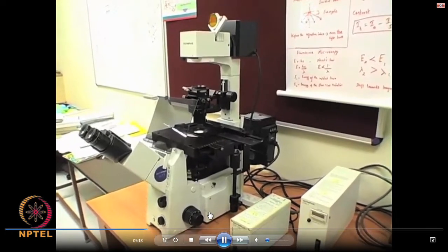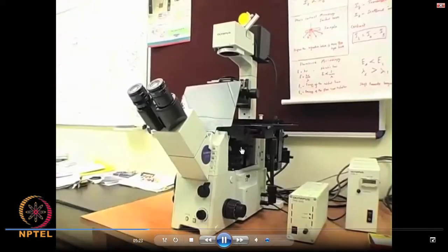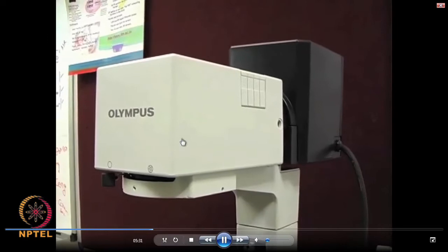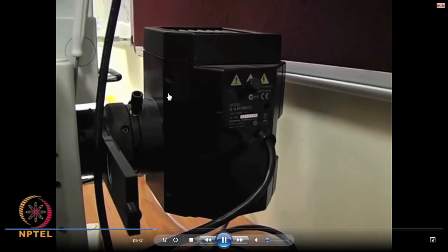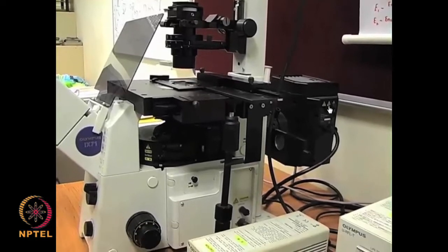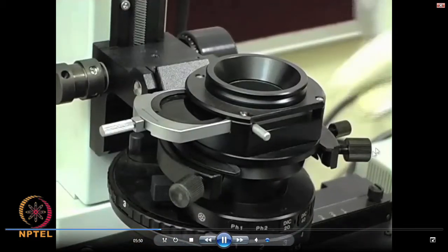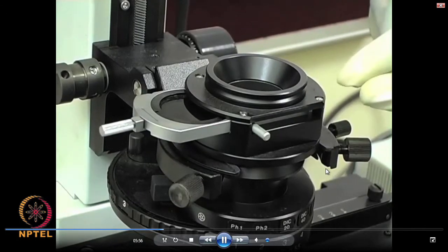So this is an optical transmission microscope, which has two illuminating systems. One is a halogen lamp, this one, and this is a mercury vapor lamp. So it is being shown closely for your clarity: halogen lamp, mercury vapor lamp. These two are used for specific applications. I will mention them whenever applicable. So have a look at how the architecture is very different from the simple vertical microscope.